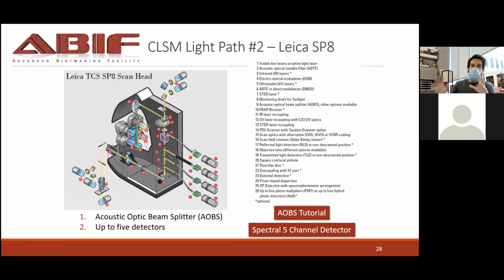It's all based on a similar thing where there are scanners and pinholes and all that, but it is important to have an idea of a little bit more closely how the system you are using is actually functioning to be able to actually adjust it properly. And so that's it.